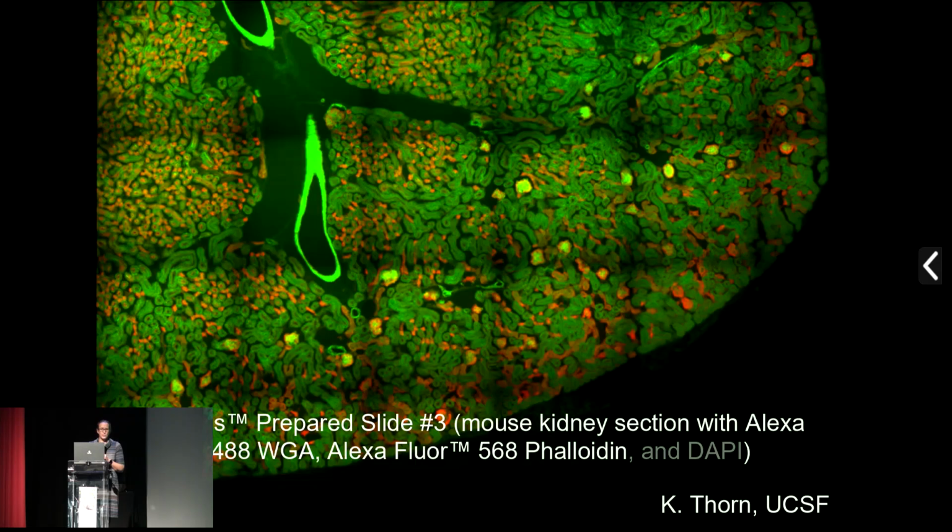Now, Kurt here has very wisely used stitching and tiling. Stitching and tiling is great because you can take an image with a fairly modest magnification objective lens with a quite high numerical aperture, then you move the specimen, take another image and so on, and then computationally stitch and tile them together to form one larger image. But these dark bands can cause problems, especially for quantitative analysis of data sets.